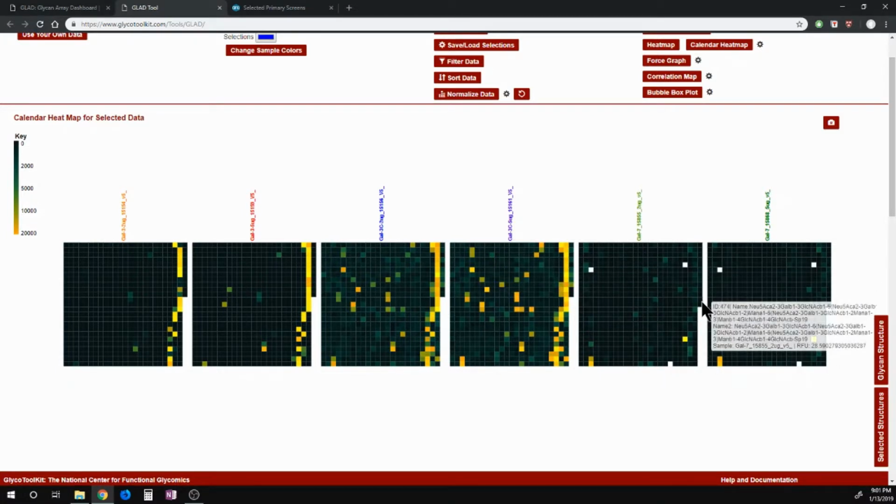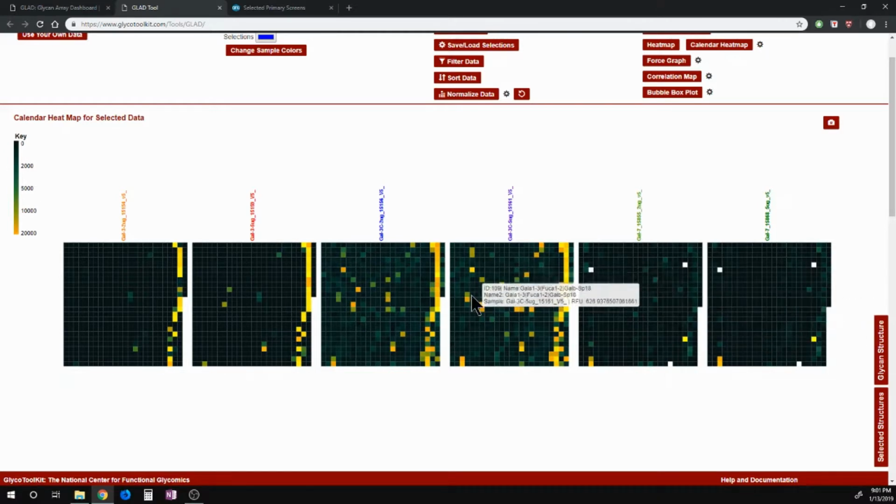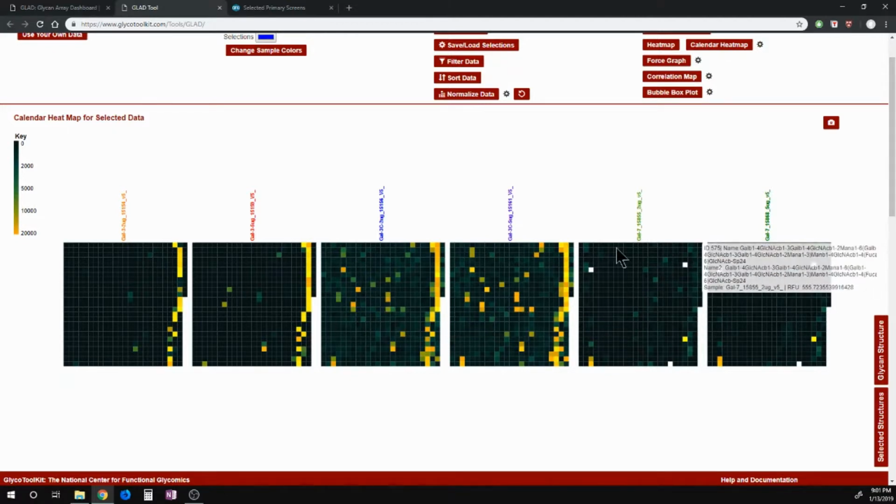And on the other hand, you have some glycans towards the end of galectin 7, which were not there in the earlier galectin 3 experiments. And this is because on the CFG website, it shows that the galectin 3 and 3C data was collected on CFG version 5.0 type glycan microarray, whereas galectin 7 was collected on the CFG version 5.1.